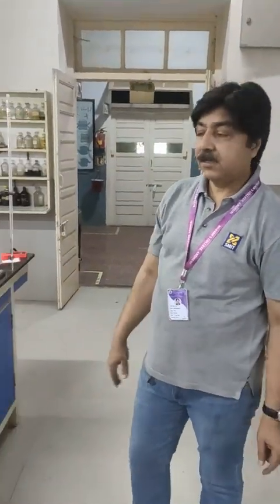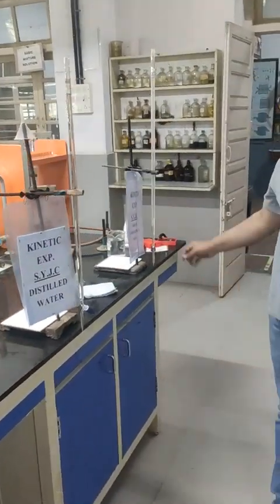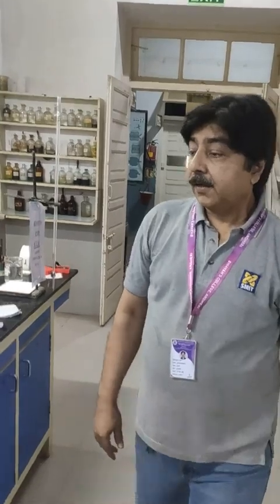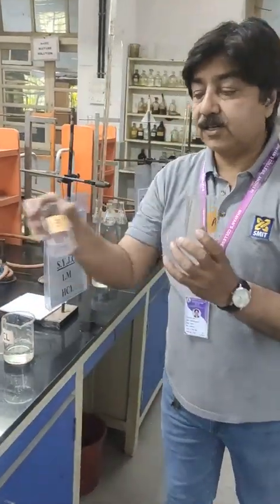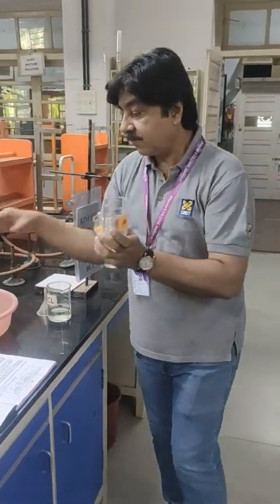So now we have 3 different burettes. The first burette is filled with 1 molar HCl solution. The second burette contains distilled water, and the third burette contains sodium thiosulfate solution, Na2S2O3 solution. We are going to take 4 readings in 4 different containers labeled A, B, C and D. So let us begin with the first reading, A.